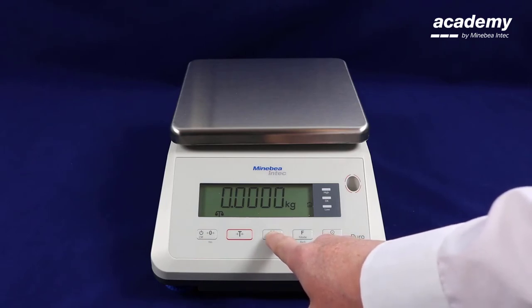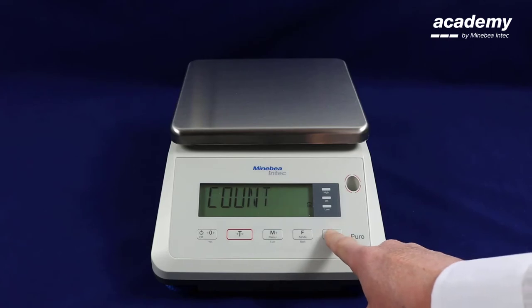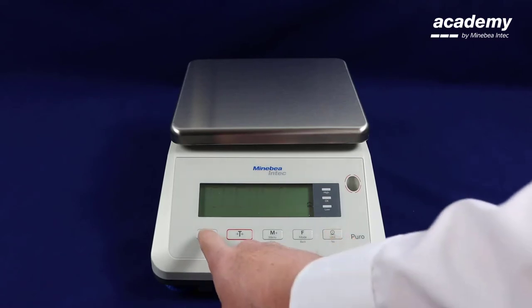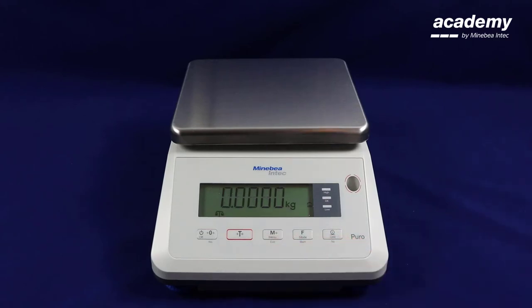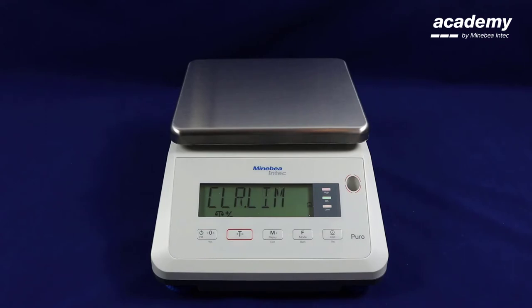First we have to activate the check weighing application. Press and hold the menu key, press yes to accept on application and scroll until you find the check weighing. Press yes again to accept. Now we turn it on and press yes. Press back to go back into the main screen. To get into the application, press and hold the function key until you see check weighing appear on screen. When you release the key the check weighing application has been activated, as you can see in the symbol.